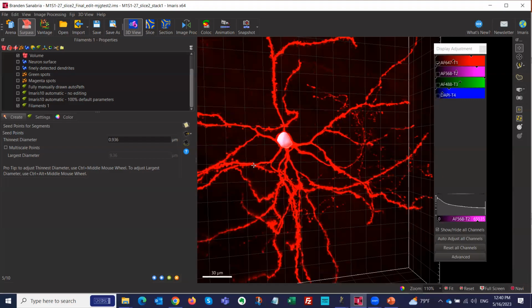It's only if you have a big gap. Even if one is 1 and the other one is 1.5 microns, it's still in the same range. So really, if there's a big difference. In this case, I don't need to use multiple, but I'm going to show you an example at the very end where you definitely need to use multi-scale points.